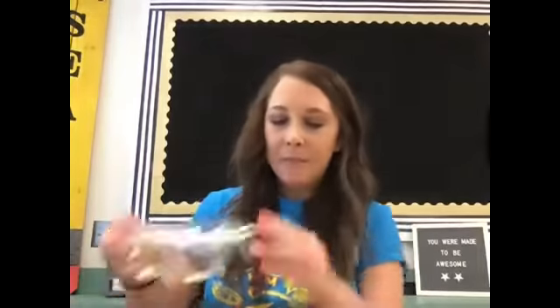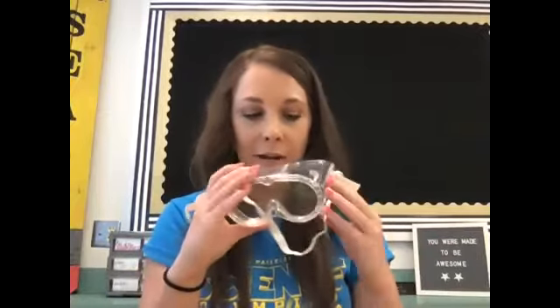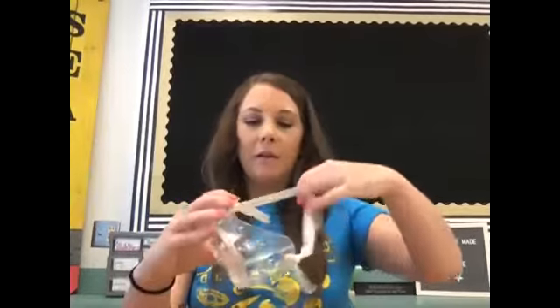So I'm gonna show you one science tool that scientists use to be safe, and they look like this. Does anybody remember what these are called? We talked about these in kindergarten. You even got to wear them in kindergarten. If you said goggles or safety goggles, you are correct. These are called safety goggles, and scientists use these to protect their eyes and to keep things from getting into their eyes. So for today's experiment, I'm going to wear safety goggles because I am using some things for this demonstration that I do not want in my eyes.